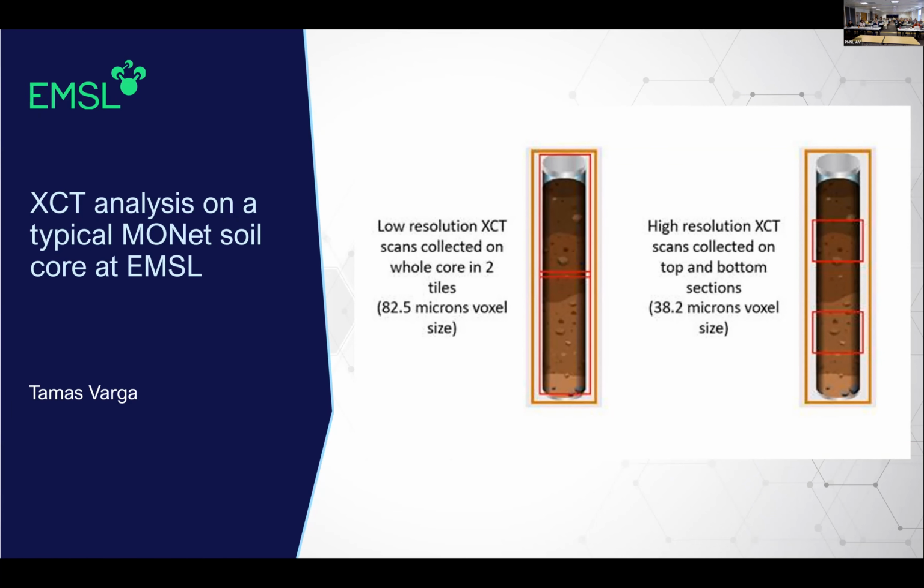But back to the previous question, if you were to obtain this data on the whole core, it would be 5 2.5-hour scans just for the high resolution, and then you have issues with throughput, and of course person time and the data to analyze. But 8 hours is the short answer for these 4 scans.